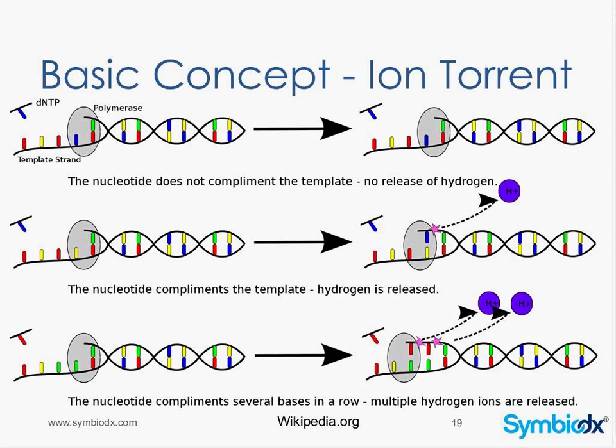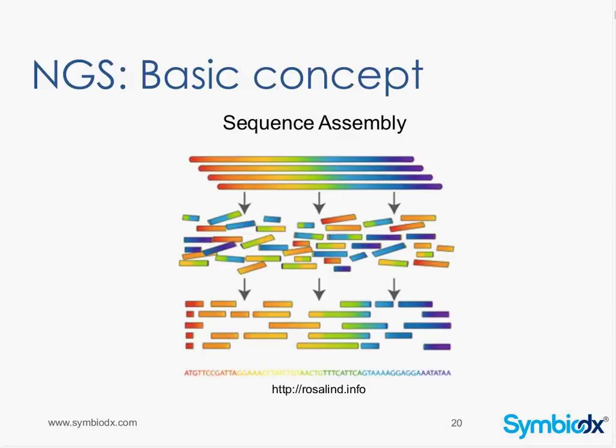So it's less accurate in accurately determining ranges of repeat bases. It also is a little bit less accurate in determining insertions and deletions where you have little pieces of DNA that are either added or missing. However, I will say that both of these companies have been rapidly increasing the quality of their technology, and both are really fairly similar currently.